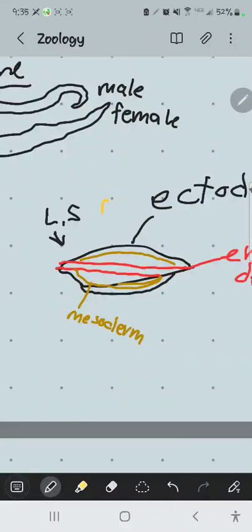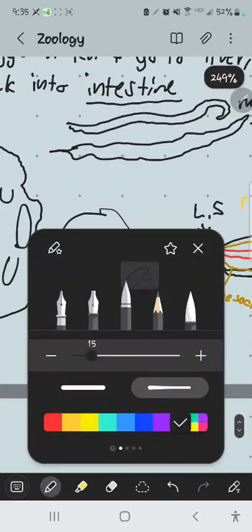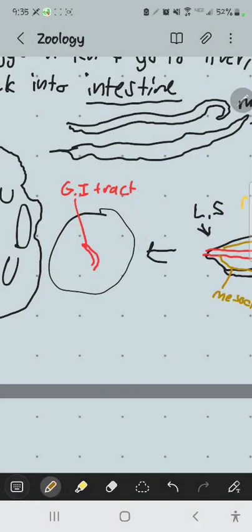So here's our ectoderm. Here is our endoderm. The gut is actually kind of flat, what looks like a flat strap. This is our endoderm, and we can shorten this to be like a G, gastrointestinal tract. And then the mesoderm is lining only the outside cavity, like so. All right, and then again on that slide that I have here, this cavity is called a pseudocoelom.